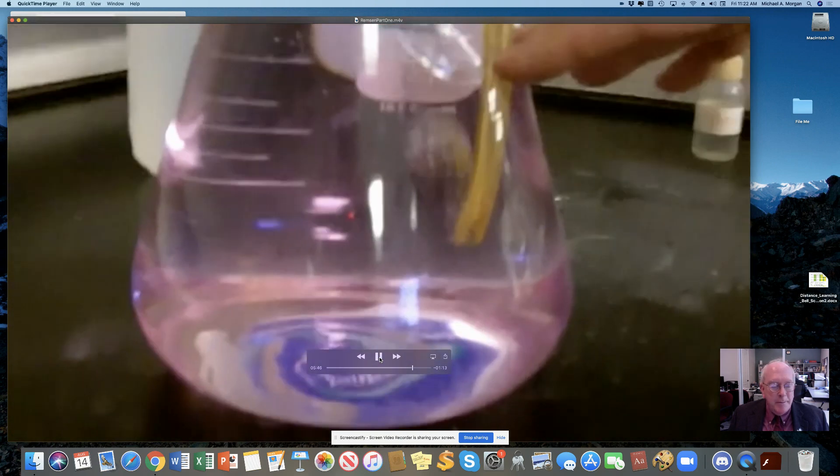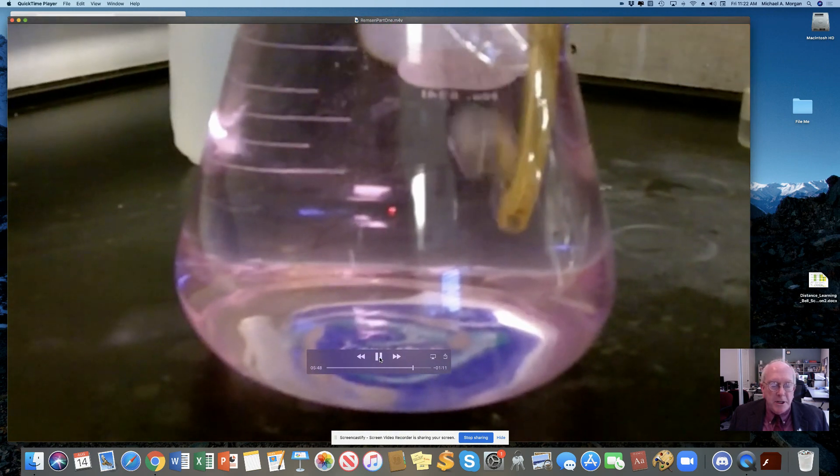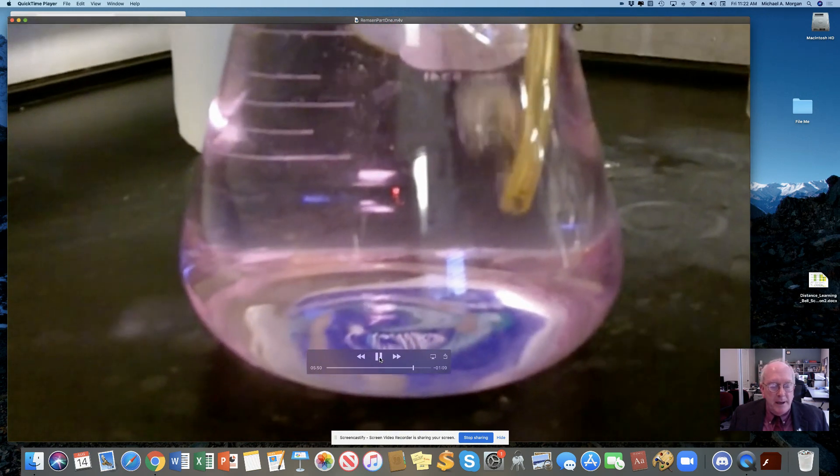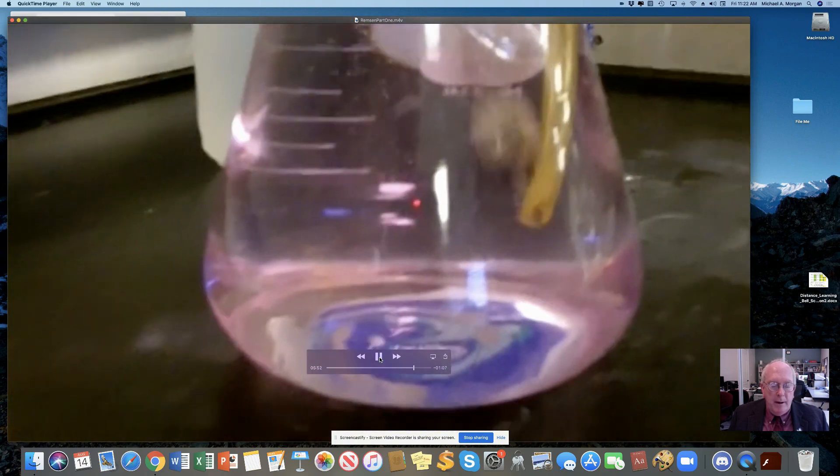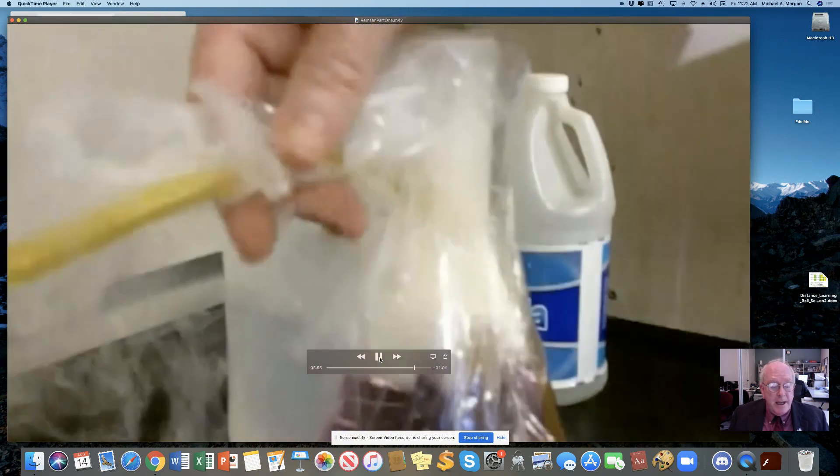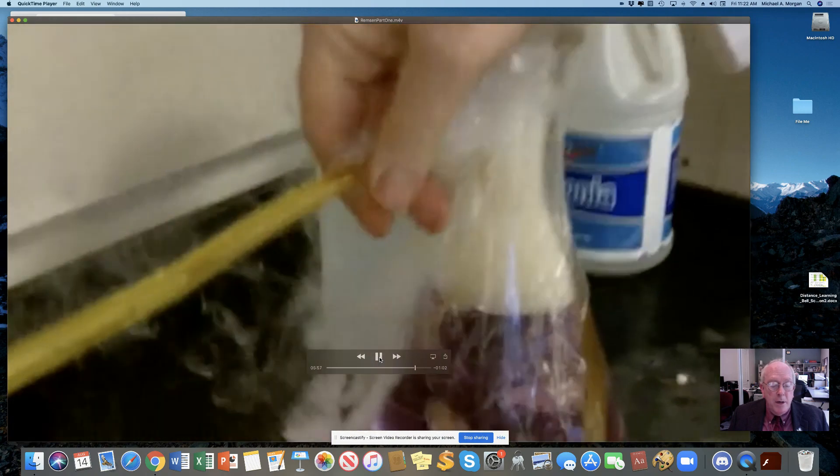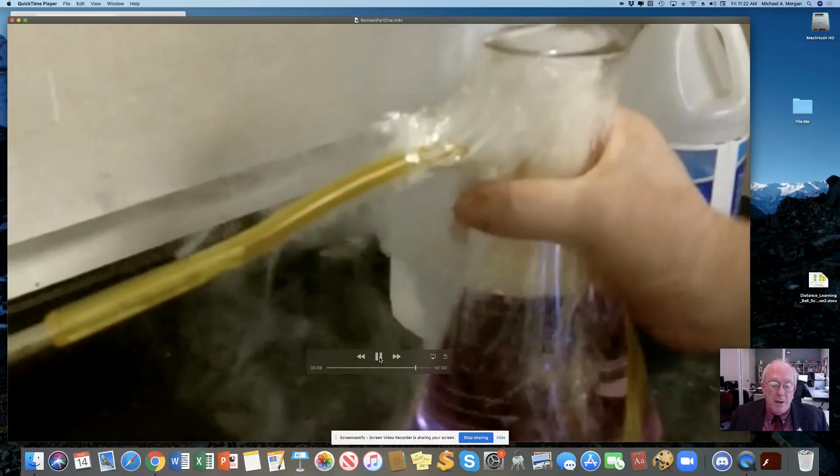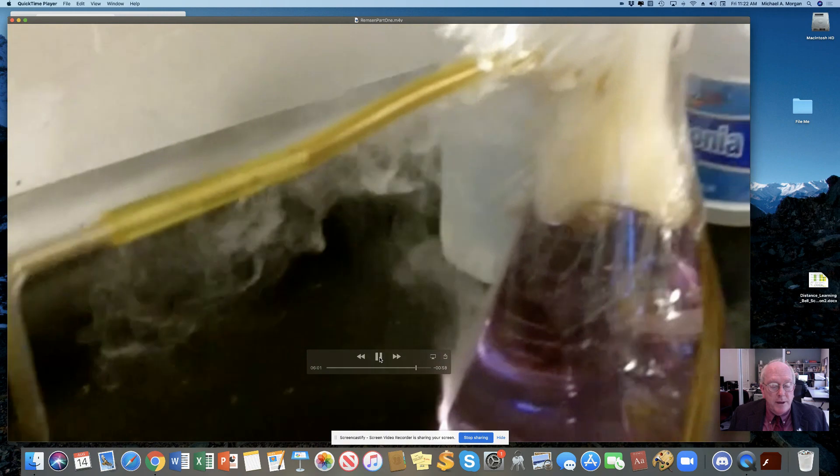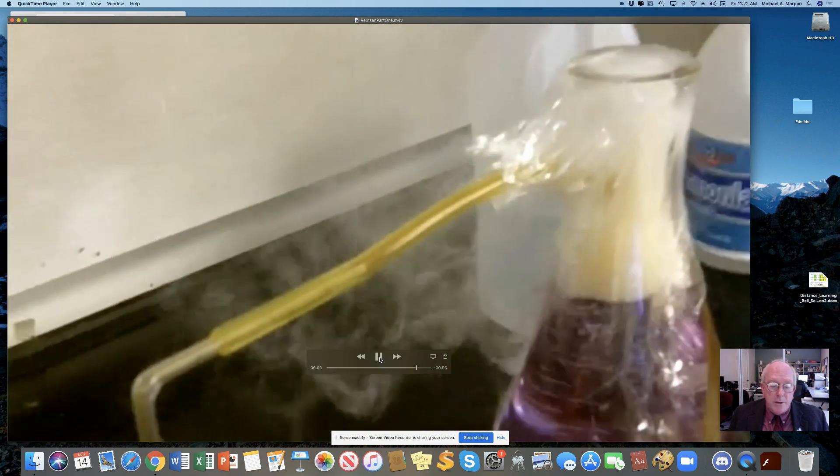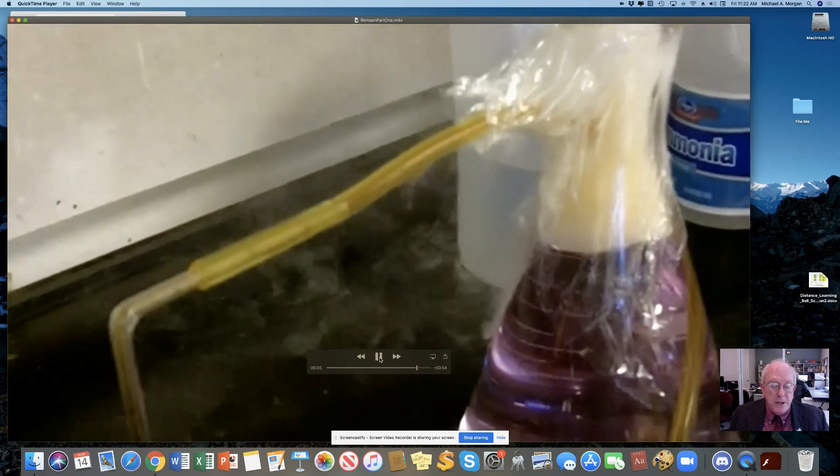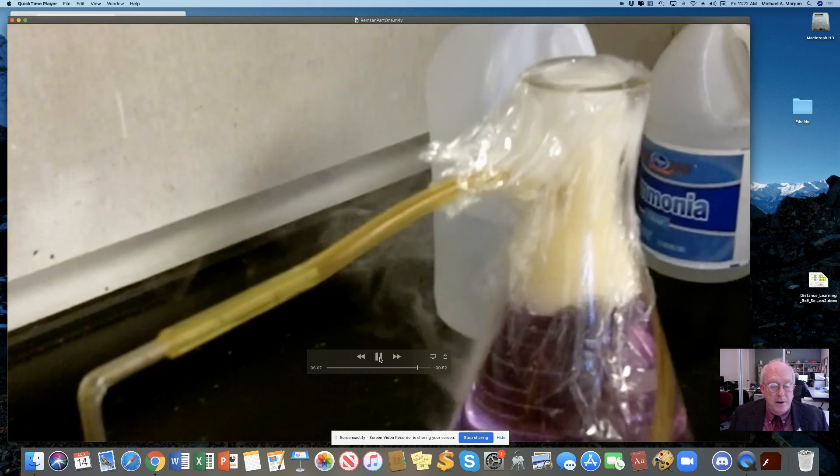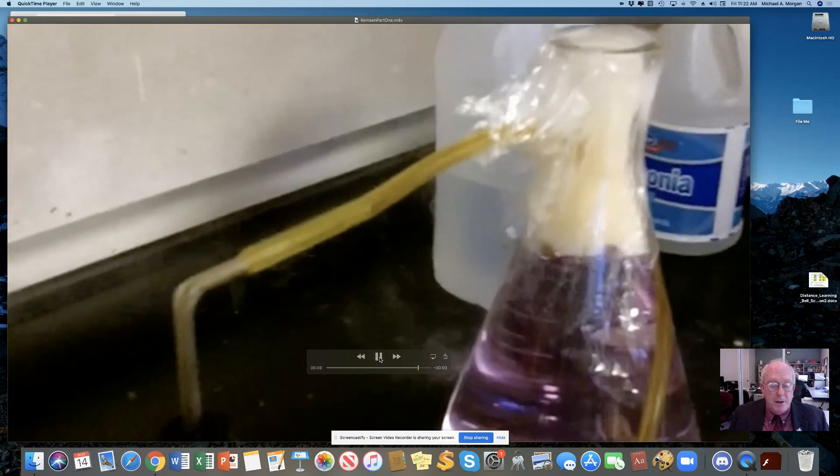How should I stop this? I tried to get rid of the objectionable mess by picking it up and throwing out the window, which I had meanwhile opened. I learned another fact. Nitric acid not only acts upon copper, but it acts upon fingers. The pain led to another unpremeditated experiment. I drew my fingers across my trousers, and another fact was discovered. Nitric acid acts upon trousers.